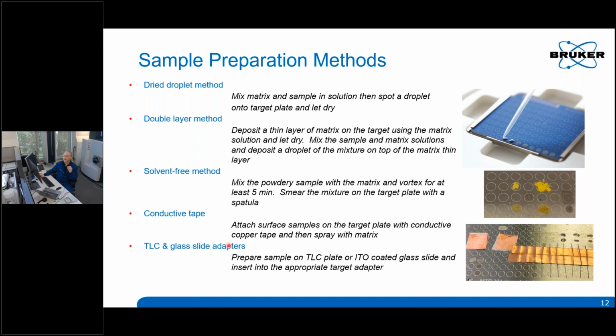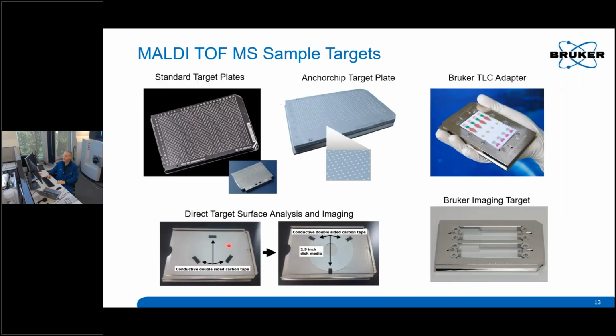We also have TLC and glass slide adapters, which we can see here. The TLC plate fits in the TLC adapter, and here is the slide adapter used for imaging. We also have pictures of them here on the slide. Today we'll be using one of our standard targets, the MTP-384. We're going to use the ground or matte steel finish.